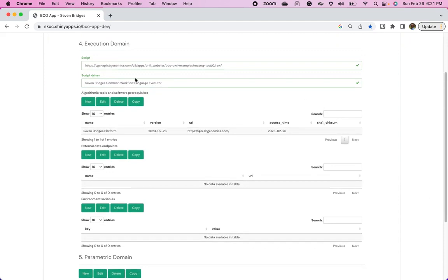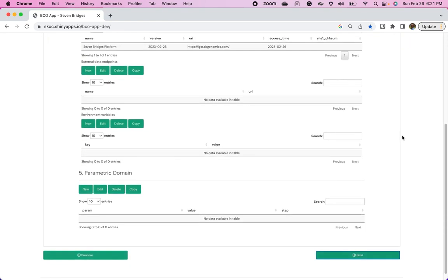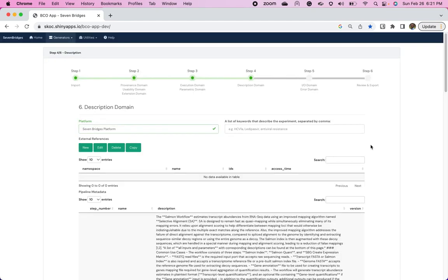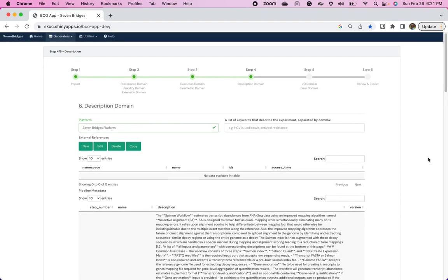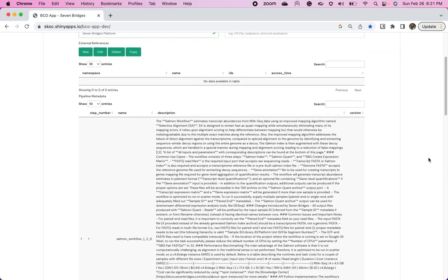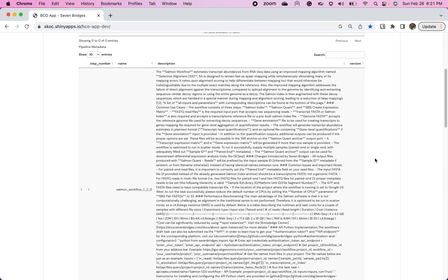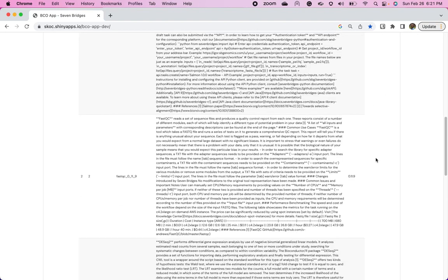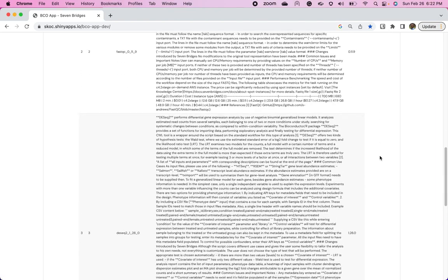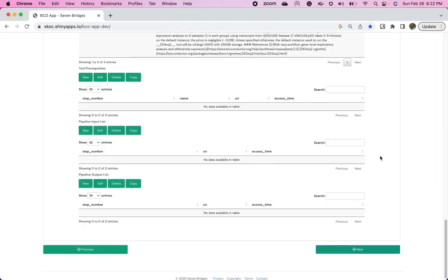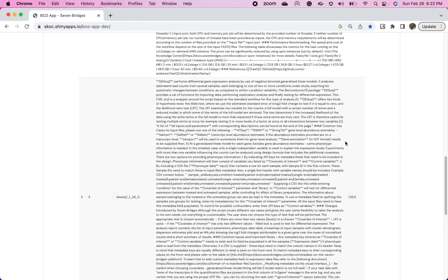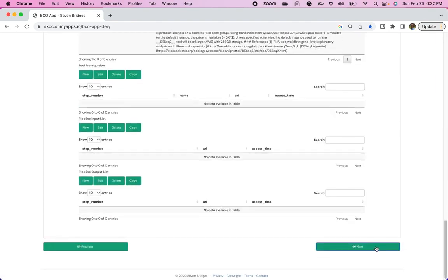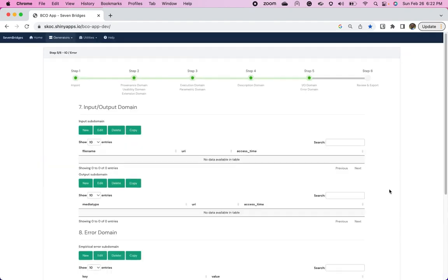There's an execution domain. So where is it executed from? It's the Seven Bridges platform. Now Velsera. If you missed it. There's a description domain. So each node in that workflow, each step, has an explanation here that I added. It's really a conglomeration of other workflows and other apps available on the Cancer Genomics Cloud. And so all that information will be here. Because I put it there.